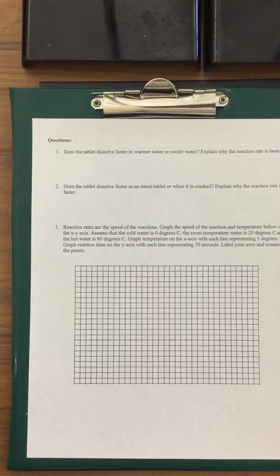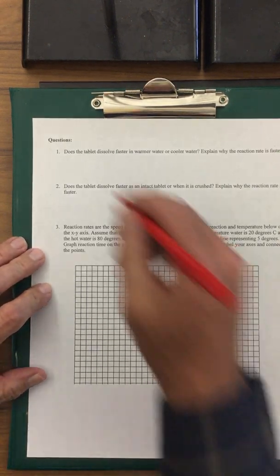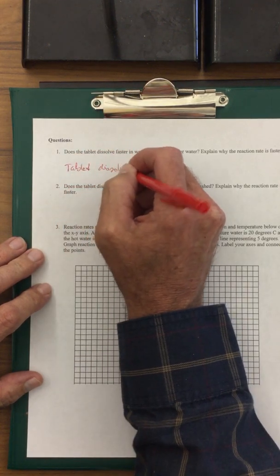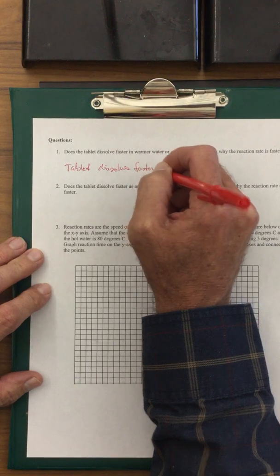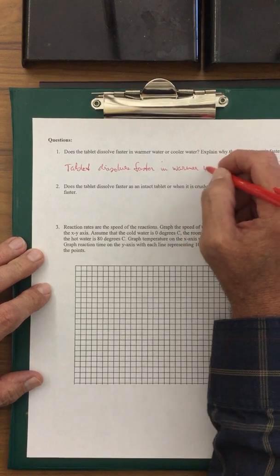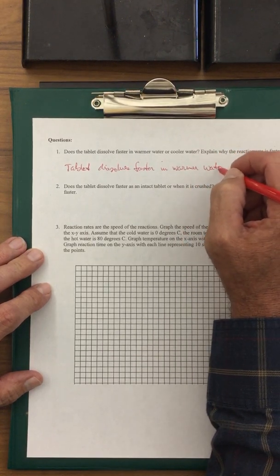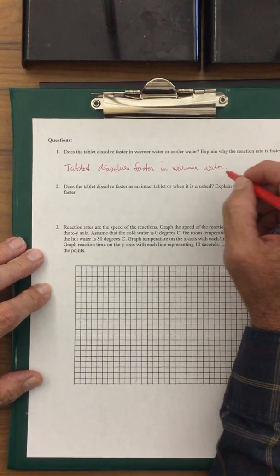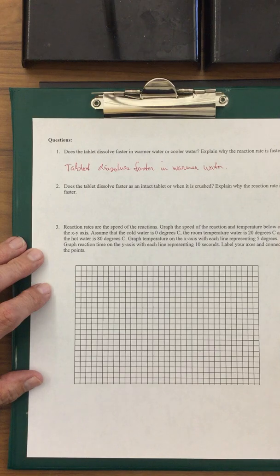Does the tablet dissolve faster in warmer water or cooler water? So the tablet dissolves faster in the warmer water. Explain why the reaction rate is faster. So it's faster in the warmer water. This is due to the molecules of water moving faster inside of itself, and so therefore it can react with the tablet faster since they're moving faster.